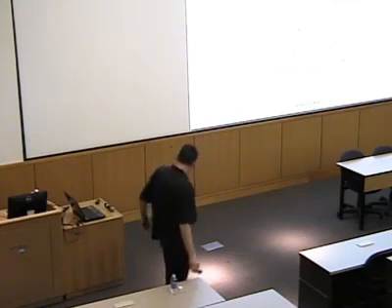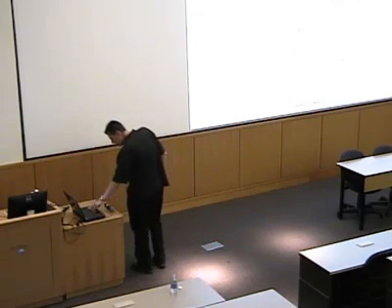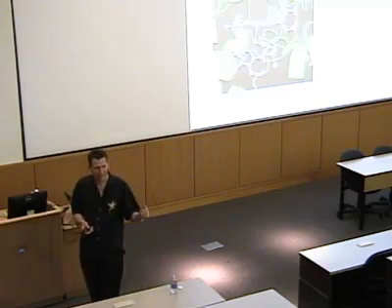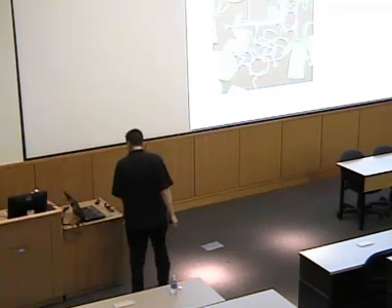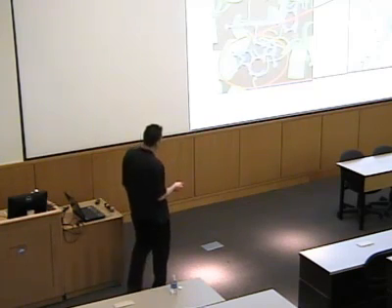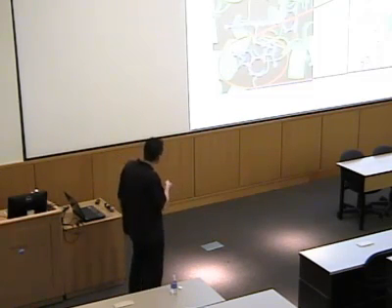C-term signal. Okay, so now we're kind of running out of time, so we're going to take a little jump. After we had established that this actually works and we can identify polarized transitions by their saturation behavior, we now took this over to a cytochrome P450. This is P450 CAM. And in particular, in this case, we have this famous Cys pocket. So there is this hydrogen bonding network wrapped around the axial cysteine ligand here.